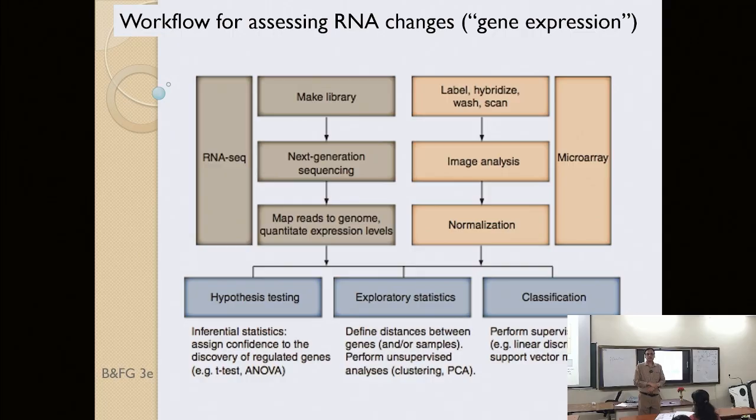And also, once you have obtained the abundance of RNA transcripts in terms of the counts of reads that mapped onto the genes, you can perform clustering of the genes in terms of their gene expression patterns. So basically, in terms of the abundance of the RNA transcripts arising from them. Okay, so if 2 genes are expressing similarly, they would have a similar pattern of transcript abundance, right? So they should group together.